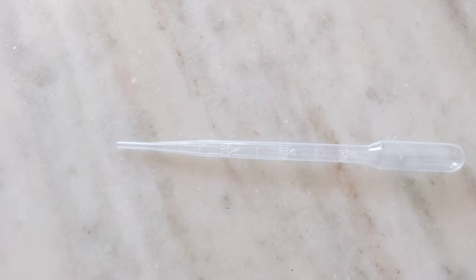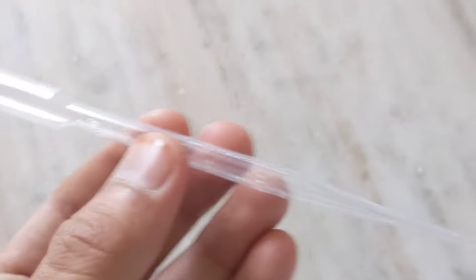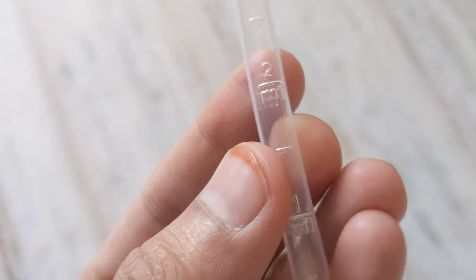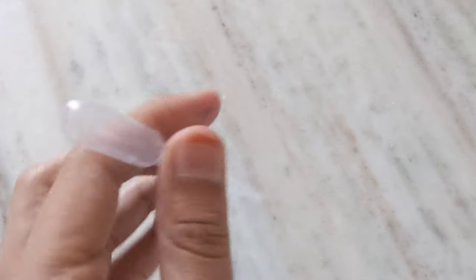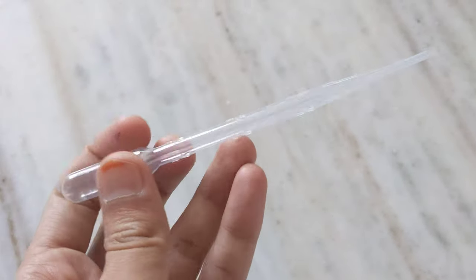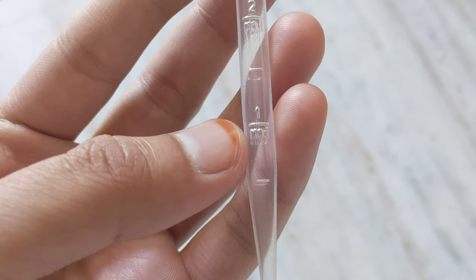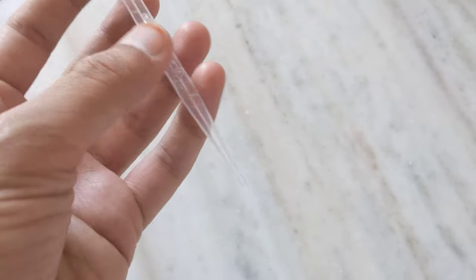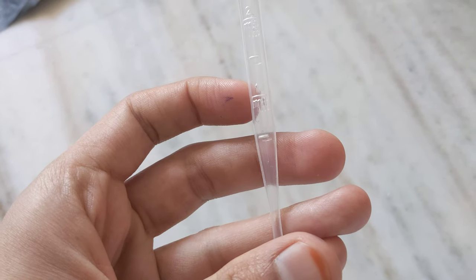Hello friends, today we'll be learning what a pipette is. As you can see, this is a pipette — it is a small plastic measuring equipment. It is marked as one milliliter, two milliliter, three milliliter. These marks are from the bottom, so from the bottom to here is one milliliter.